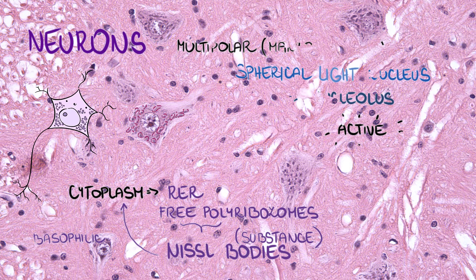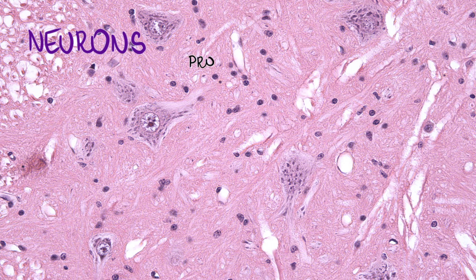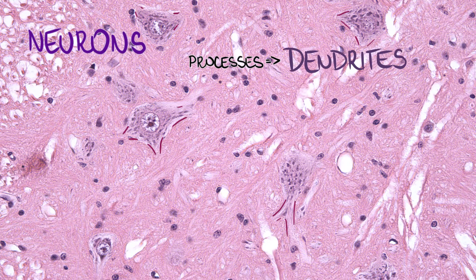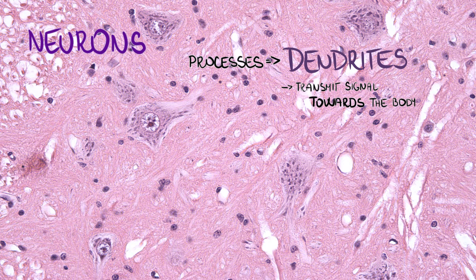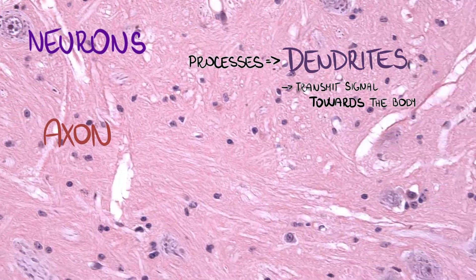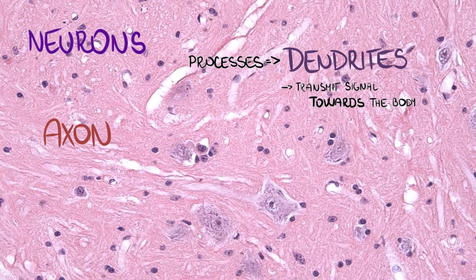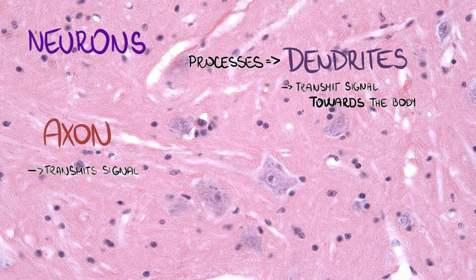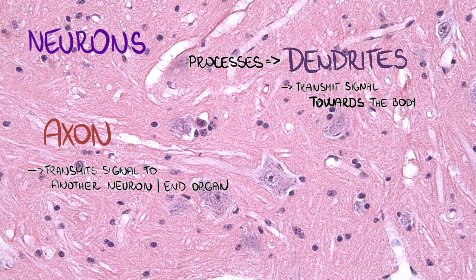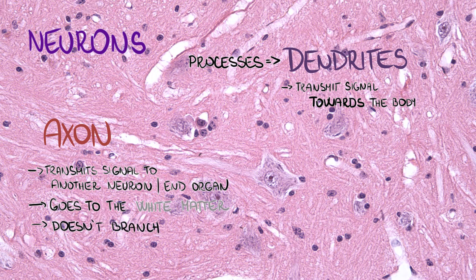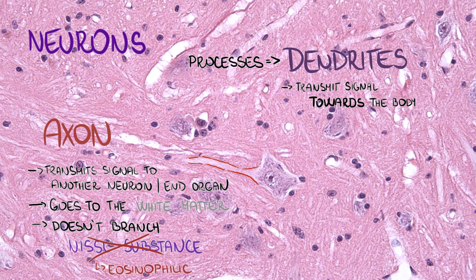We can also differentiate processes of neurons such as dendrites, which transmit signal towards the body, and one axon that transmits signal to another neuron or to an end organ and goes to the white matter. The axon doesn't branch, doesn't contain Nissl substance — that's why it's eosinophilic — and is heading to the white matter.